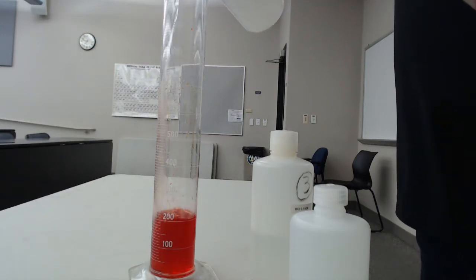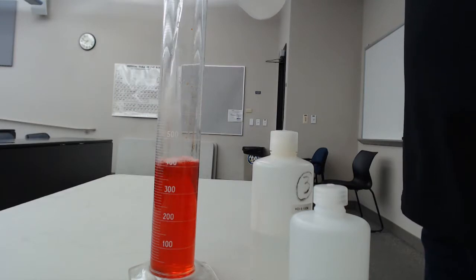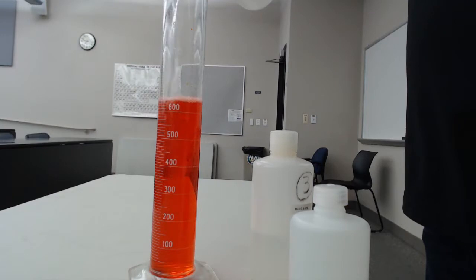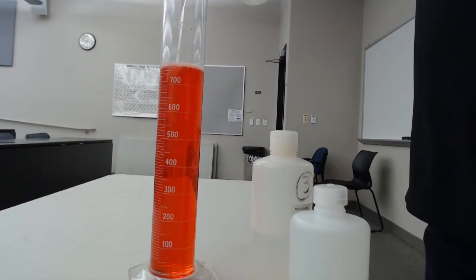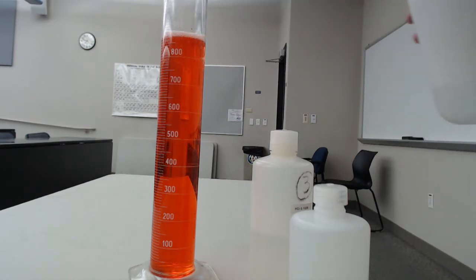Anyway, I'm adding a little bit of water in here. It's not going to change the pH by a significant amount, we're just diluting it. It's still going to be acidic, but it should change color if I add some base to it, right? Because this is an acid-base indicator.